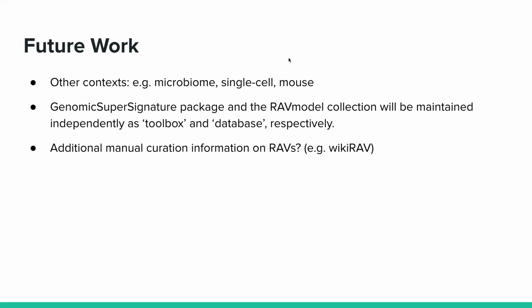And yeah, I'm also thinking about the challenges when we apply that not to bulk RNA-seq, but to single cell RNA-seq. There again, there is now a little bit of movement away from these UMAPs, but rather to, like Rafa, as Robert said, did this GLM PCA as a generalized version of PCA that could maybe be used here for single cell data. Or Wolfgang Huber, together with one of his PhD students, Konstantin, I think, just put out this paper, which is basically saying if you do your shifted logarithm and standard PCA, you are actually in a pretty good spot. So that seems to be pretty much what Seon did here.